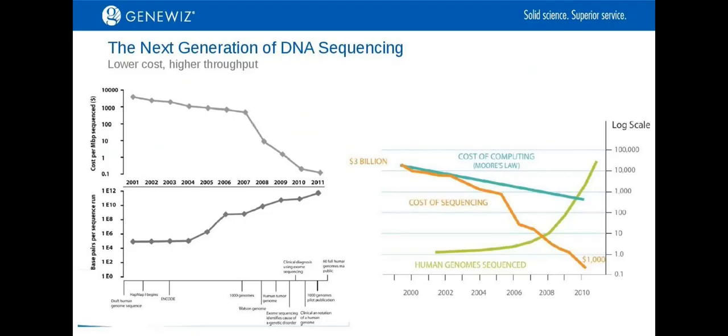The next decade focused on unlocking the true power of NGS. Developers focused on scalability of NGS. As you can see on the left, there was a steady inverse relationship between the cost and the throughput. The cost was steadily declining while the throughput was going through the roof. In fact, this technology was outpacing Moore's law, shown on the right.